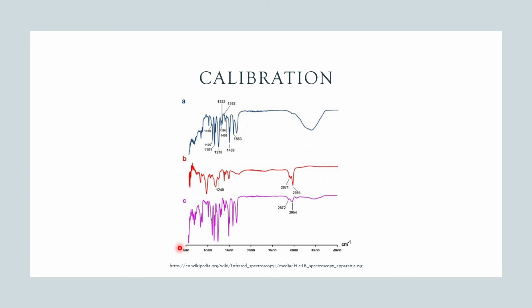So what we can see here are lots and lots of different infrared patterns that exist, and these were taken all at different times. Essentially, there are molecules in the air, such as water vapor or carbon dioxide in particular, which will resonate with infrared light. And depending on how much water or carbon dioxide is in the air, will have an impact on the amount of the original infrared light source that actually gets absorbed at each of those resonant wavelengths.